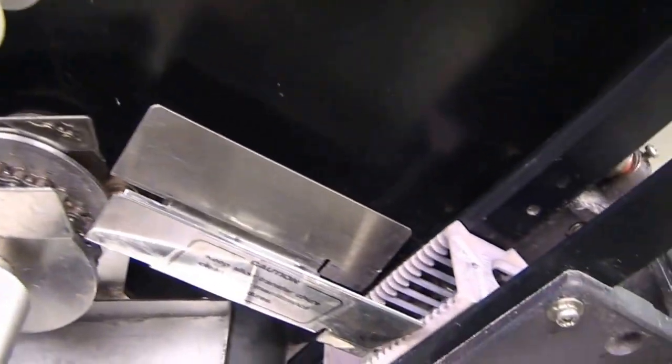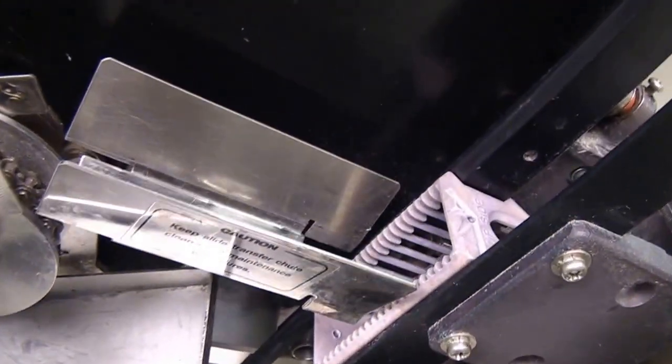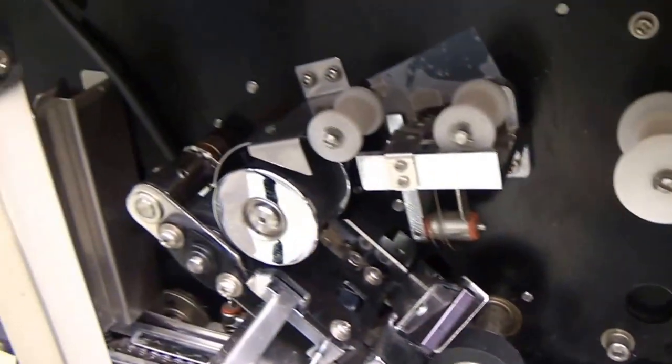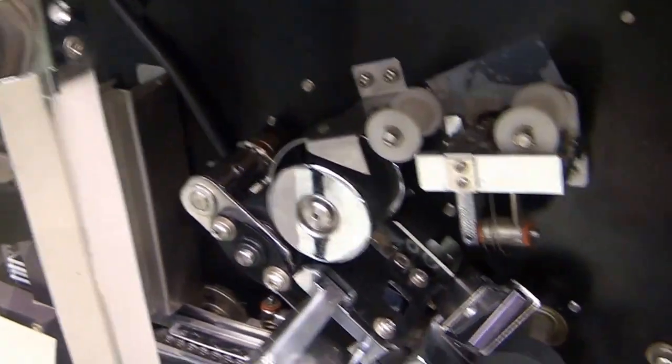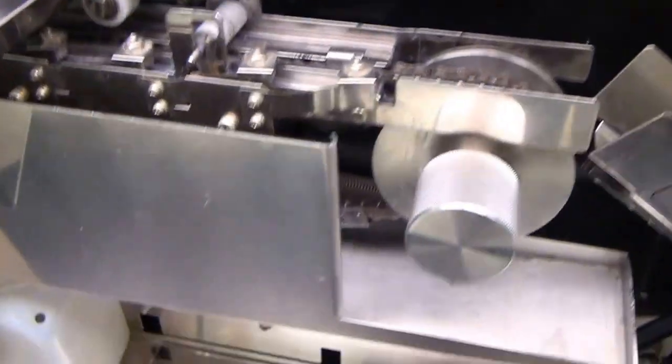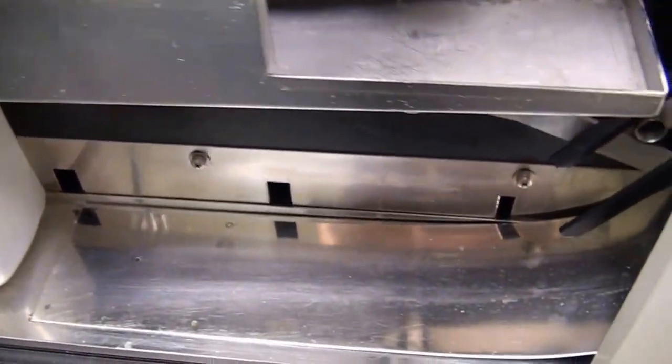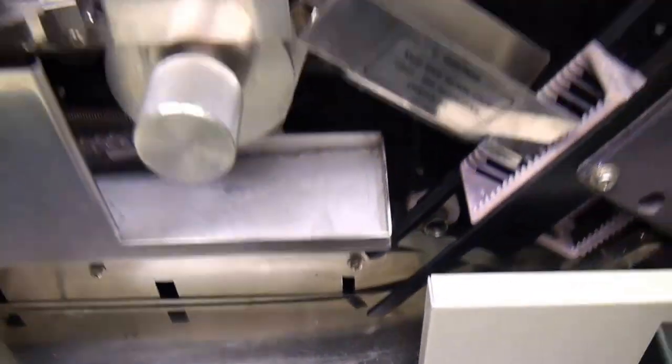Like I said, we did thoroughly clean it. This unit will come with only one basket. We do have two baskets to demonstrate this, but it only will come with one basket.